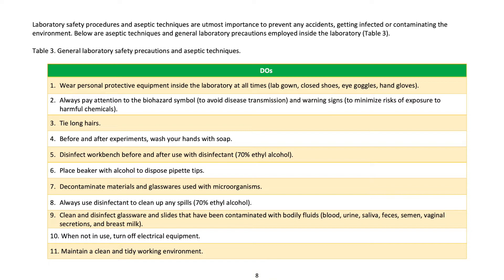Laboratory safety procedures: aseptic techniques are of utmost importance to prevent accidents, getting infected, or contaminating the environment. General laboratory safety precautions — what to do: 1) wear personal protective equipment inside the laboratory at all times: lab gown, closed shoes, eye goggles, and hand gloves; 2) always pay attention to biohazard symbols to avoid disease transmission and warning signs to minimize risks of exposure to harmful chemicals; 3) tie long hair; 4) before and after experiments, wash your hands with soap.